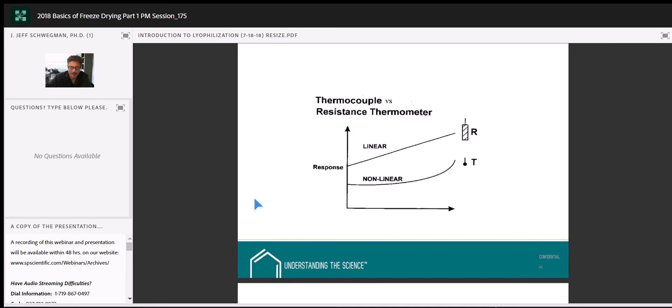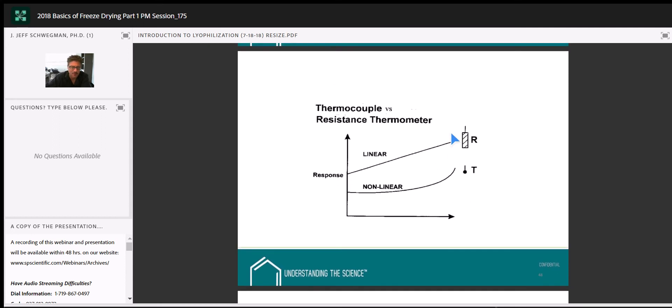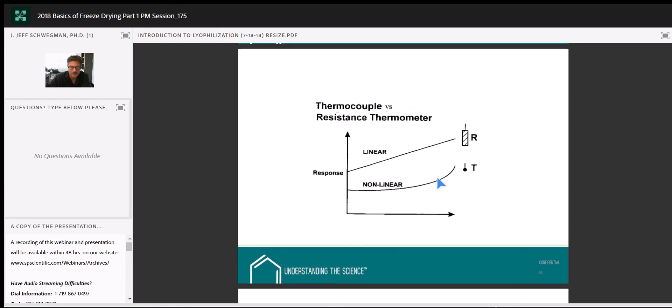Thermocouple placement: we want the thermocouple just touching the bottom of the vial, in the center. Placement that's too high or hovering off the bottom is not ideal — we want to make sure these are placed correctly.